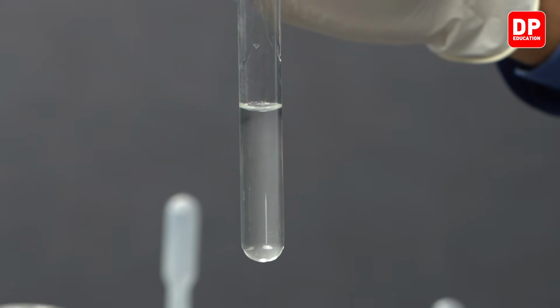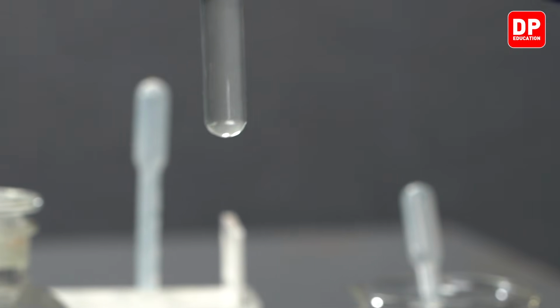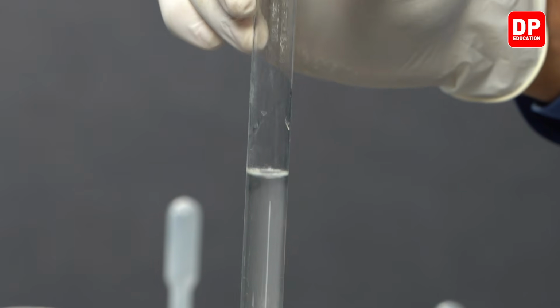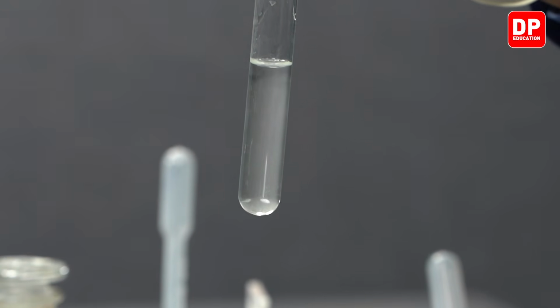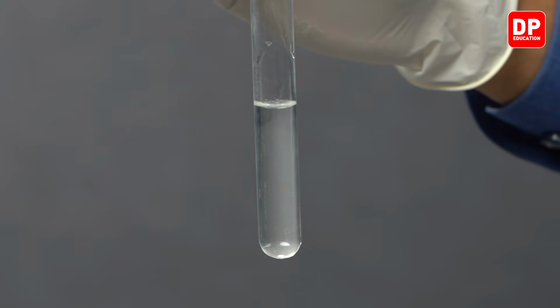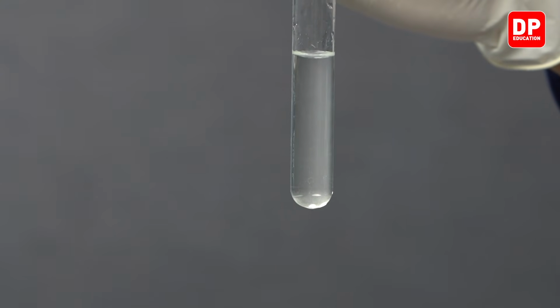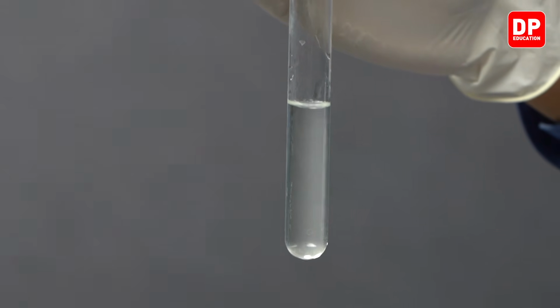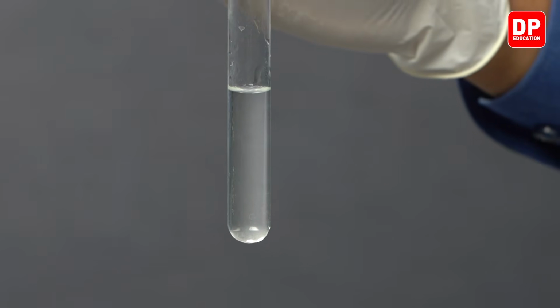clear once more. This is because when carbon dioxide is sent through calcium hydroxide, initially it forms calcium carbonate, which is a water-insoluble white color precipitate. And this white color precipitate is suspended throughout the aqueous medium, making the lime water milky. But when you send more and more carbon dioxide, this calcium carbonate turns into calcium bicarbonate, which is a water-soluble compound. So that is why the lime water that was milky will be turning back again to a clear solution when you send excess amount of carbon dioxide through the milky lime water.